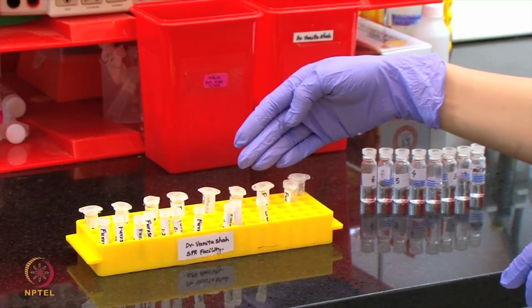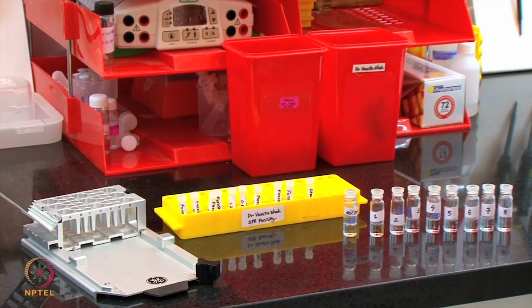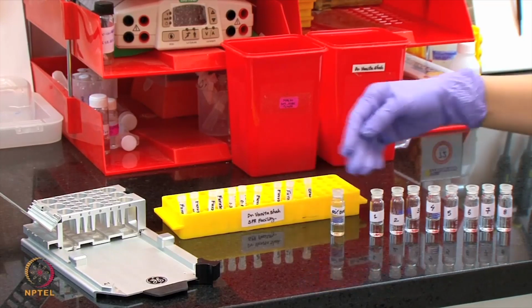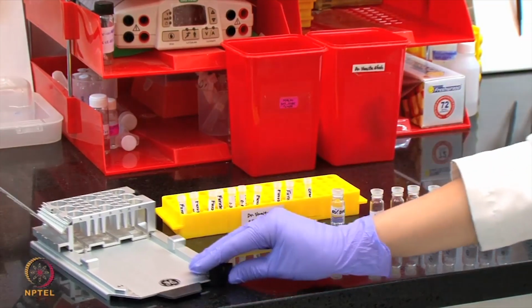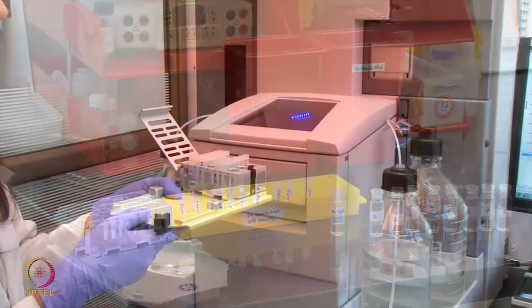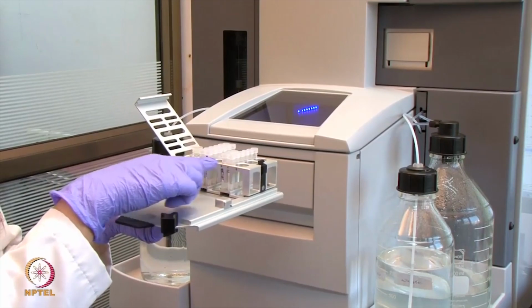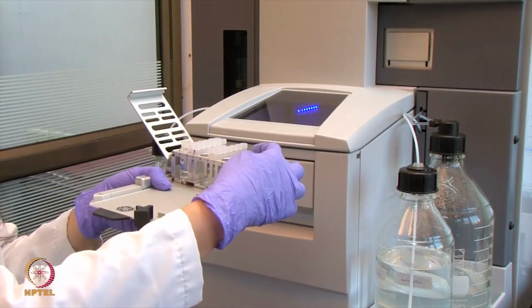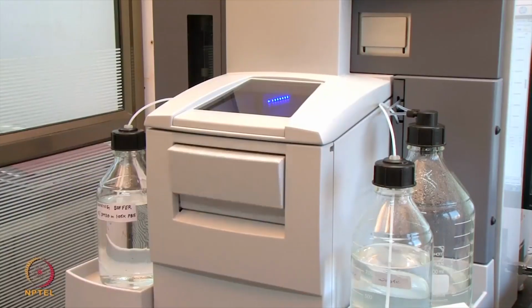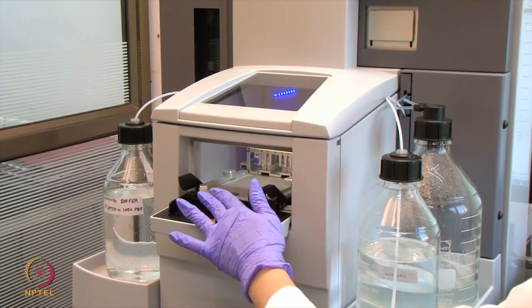All of these samples and reagents have now been aliquoted in the required volumes in these specialized tubes. We will now proceed to insert these tubes, including the samples, the startup, 50% DMSO and the solvent correction solutions into the appropriate rack and then into the system to perform the protein small molecule screening assay. We have now placed all the tubes inside the rack, including the wash solution, the furosemide samples, the startup and the solvent correction solutions. And now we will place this rack inside the system to start with our kinetic assay. We will now start with our run as demonstrated in our earlier lectures.